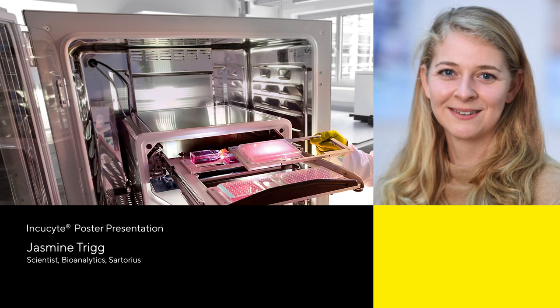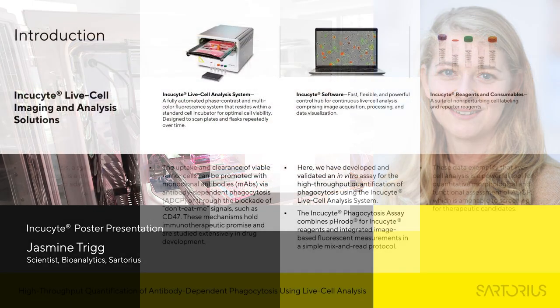Today, I'll be discussing a poster previously presented at the American Association of Immunologists conference. And the poster was titled High Throughput Quantification of Antibody-Dependent Phagocytosis using Live Cell Analysis.